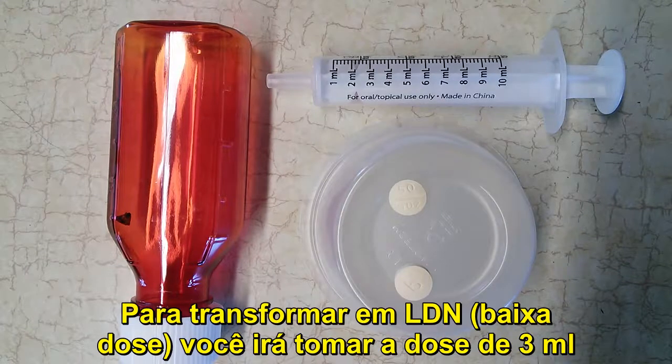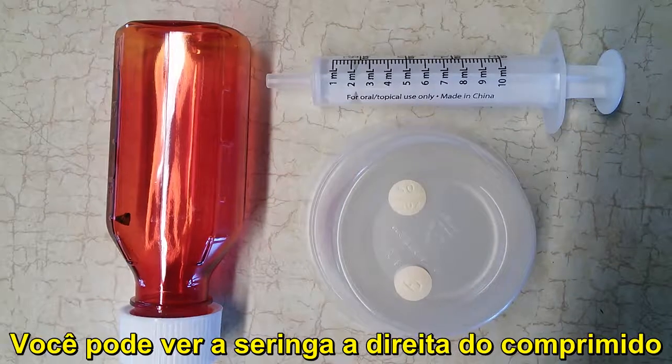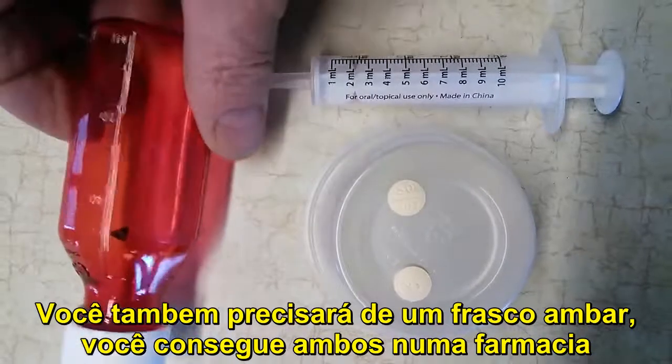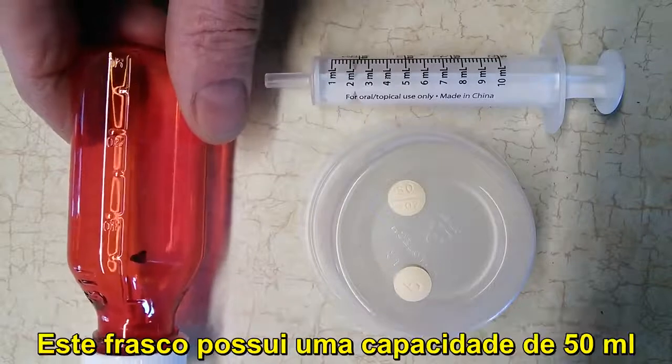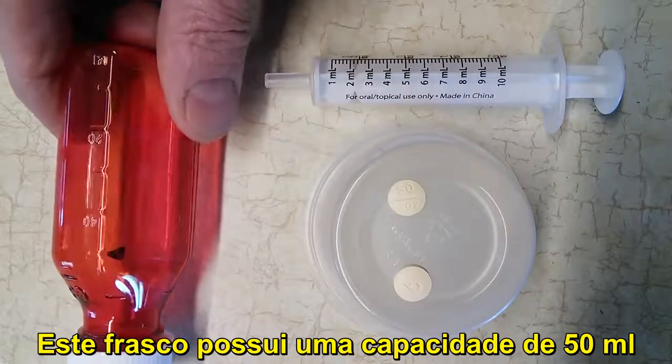To compound for low dose, you're going to be taking a dose of 3 milliliters. You can see the syringe on the right here — it has milliliter markings up to 3 milliliters. You can get both the syringe and the bottle at any pharmacy. This bottle I've marked goes to 50 milliliters, and that's where the mark is.